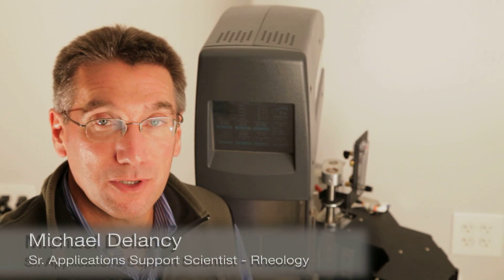This TA Tech Tip will guide you through the process to install the ARIES G2 rectangular torsion fixture.